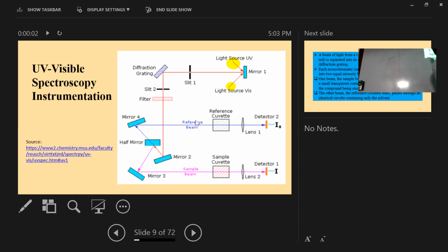So here I am giving thickness 1. Here, this is the packet, just double layer. So I am making a double layer, and I have folded it so that I can make it three layers, a triple layer. So if you have less sample here, you will observe more light.